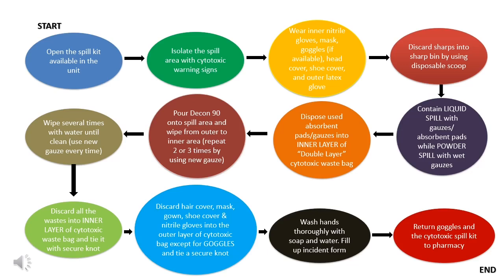To handle a cytotoxic spill: First, open the spill kit available in the unit, then isolate the spill area with a cytotoxic warning sign. Wear inner nitrile gloves, mask, goggles (if available), followed by head cover, shoe cover, and outer latex glove. Discard sharps into a sharp bin using a disposable scoop. Contain liquid spills with gauzes or absorbent pads, while powder spills should be covered with wet gauzes. Dispose used absorbent pads or gauzes into the inner layer of a double-layer cytotoxic waste bag. Pour Decon 90 on the spill area and wipe from outer to inner, repeating two or three times using new gauze.